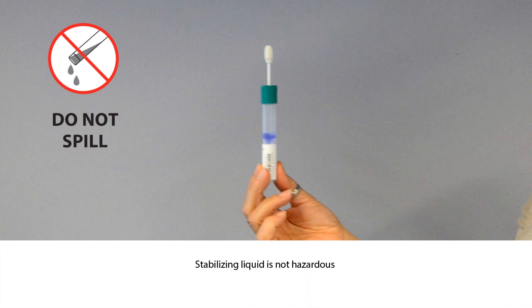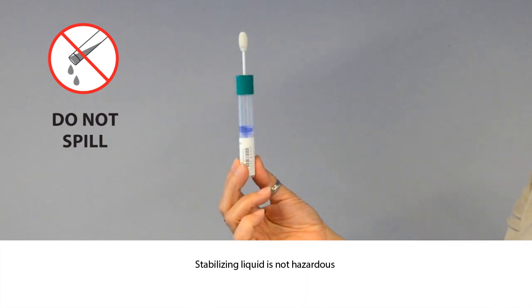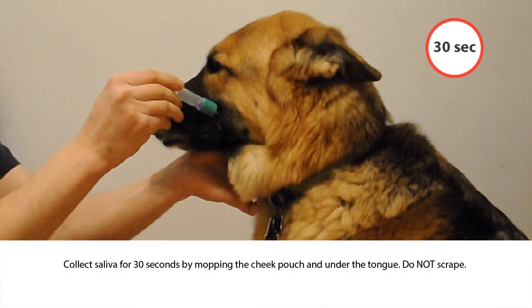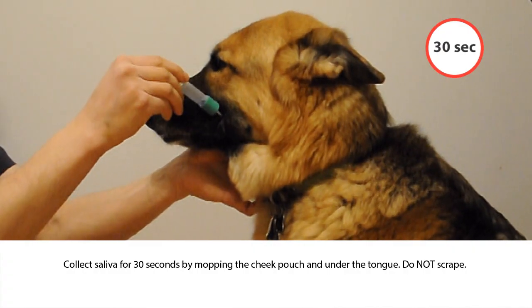The liquid is not hazardous and is required to stabilize the DNA until it is processed. Collect saliva for 30 seconds by moving the sponge and mopping saliva where it naturally pools, in the cheek pouch and under the tongue.